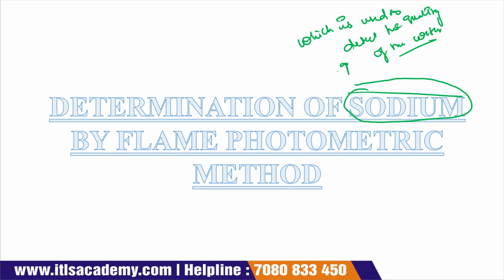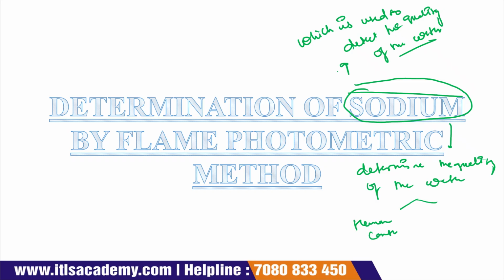Sodium determines the quality of the water for both human consumption and industrial use. We cannot use a higher concentration of sodium in an industry. That's why determining sodium is very important.